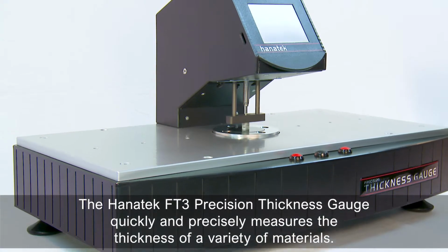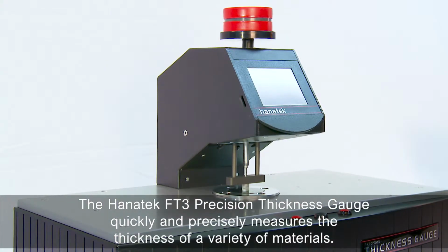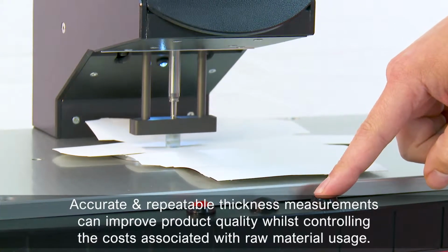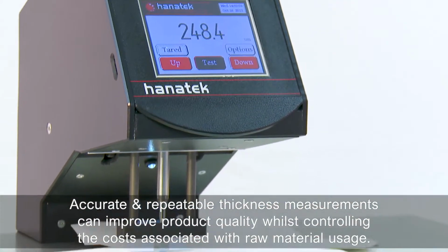The Hanatek FT3 Precision Thickness Gauge quickly and precisely measures the thickness of a variety of materials. Accurate and repeatable thickness measurements can improve product quality whilst controlling the costs associated with raw material usage.